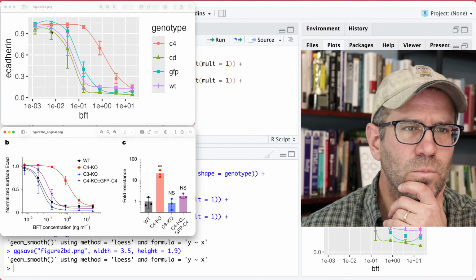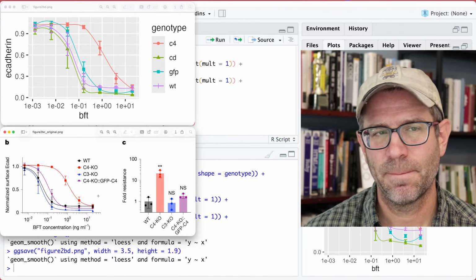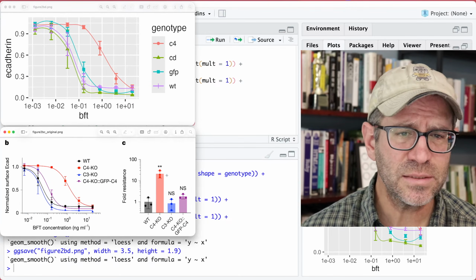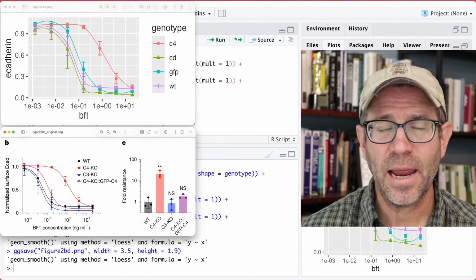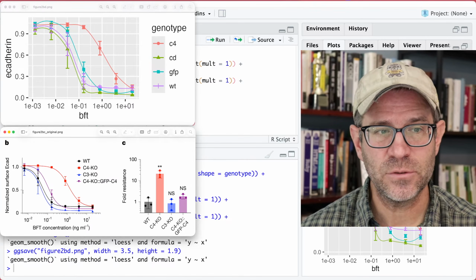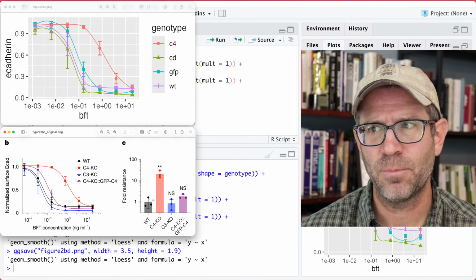Again, the fit is kind of like theirs, but not really. And that's not really a parameterized model, whereas what they're using is definitely a parameterized model that has as one of the parameters the IC50. So basically, what is the x-axis value that gives you a y value of 0.5? And that's what was getting plotted in panel C.